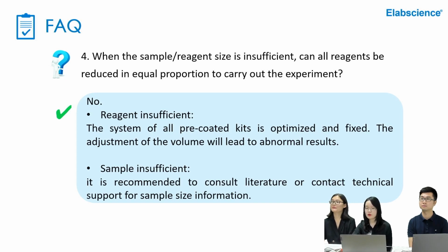It's very important to know that the detection range of the kits is not equal to the concentration range of the item in the sample, and the loading volume of samples is also not equal to the actual demand. And many items could be diluted to reduce the sample values since the kits are very sensitive.